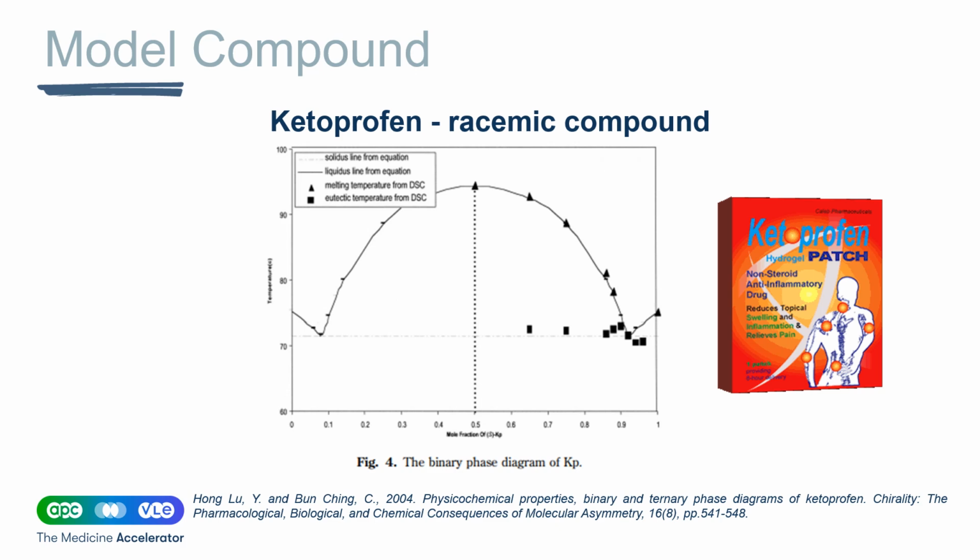Ketoprofen is a non-steroidal anti-inflammatory drug that exhibits chiral properties. Its S-enantiomer is primarily responsible for its therapeutic effects, including reducing inflammation and alleviating pain. On the other hand, the R-enantiomer has been explored as a potential additive in toothpaste formulation due to its analgesic properties. Through this study, we aim to better understand the resolution of ketoprofen.